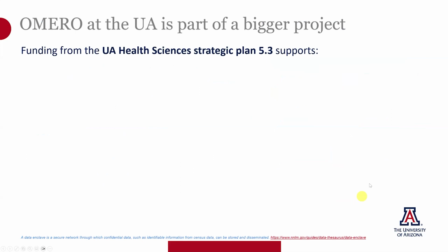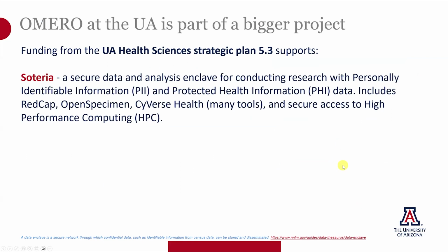The funding for Omero at the University of Arizona came from a larger project, the Health Sciences Strategic Plan 5.3, which is sometimes called the Analytics Powerhouse. And there's 3 parts that are worth noting.